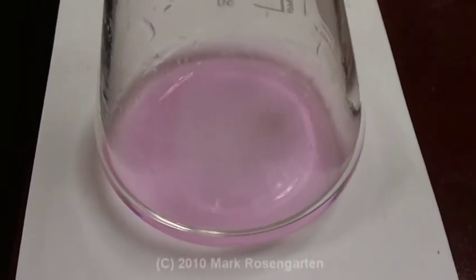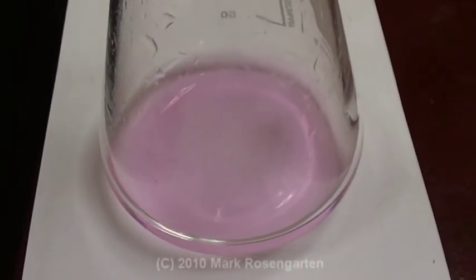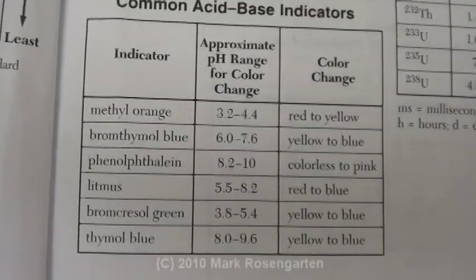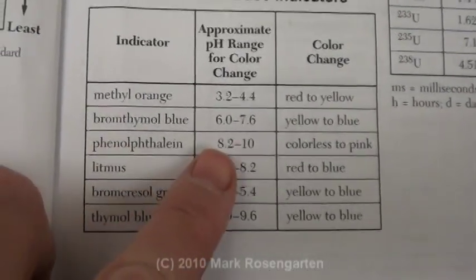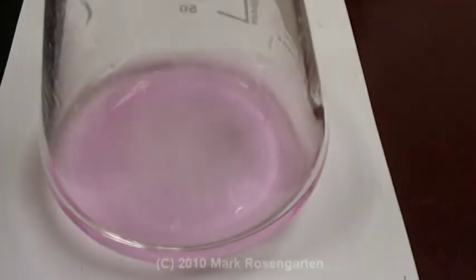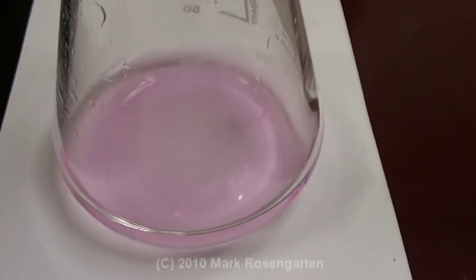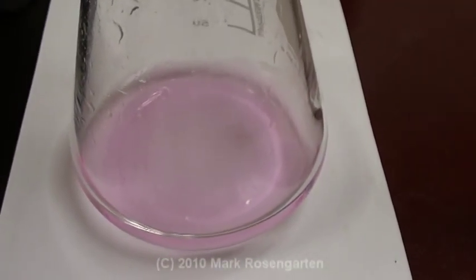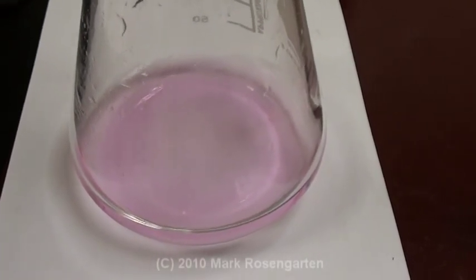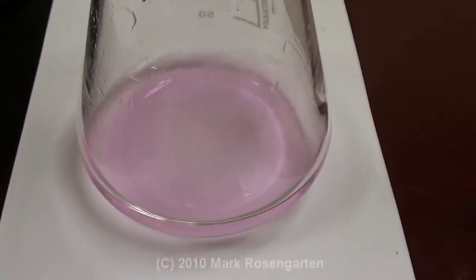And this is the perfect shade of pink that you should get after titrating. Now remember, phenolphthalein doesn't start turning color until a pH of 8.2. So what you have in here is not a neutral solution, but the difference in volume between a pH of 8.2 and a pH of 7 is so tiny that it works.